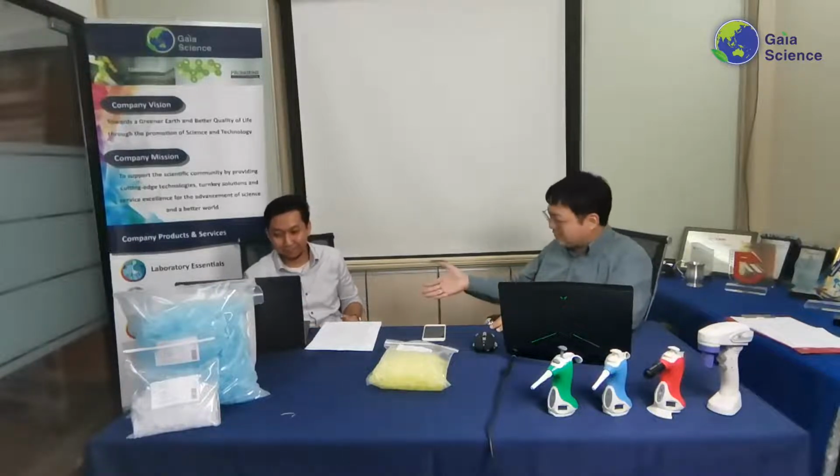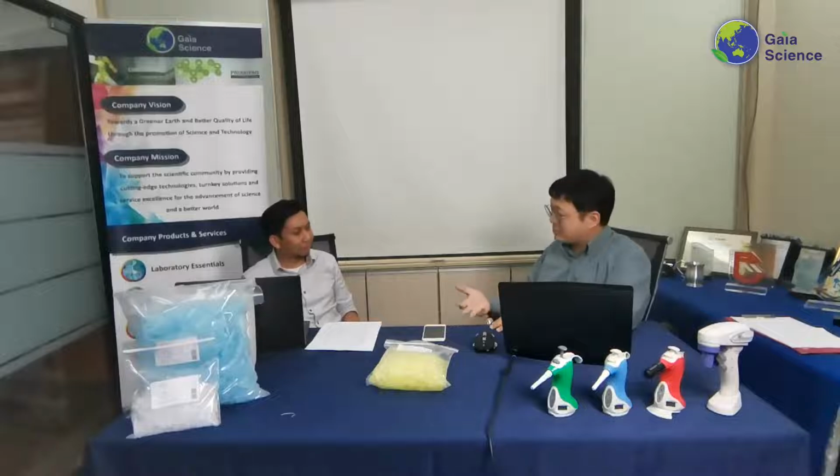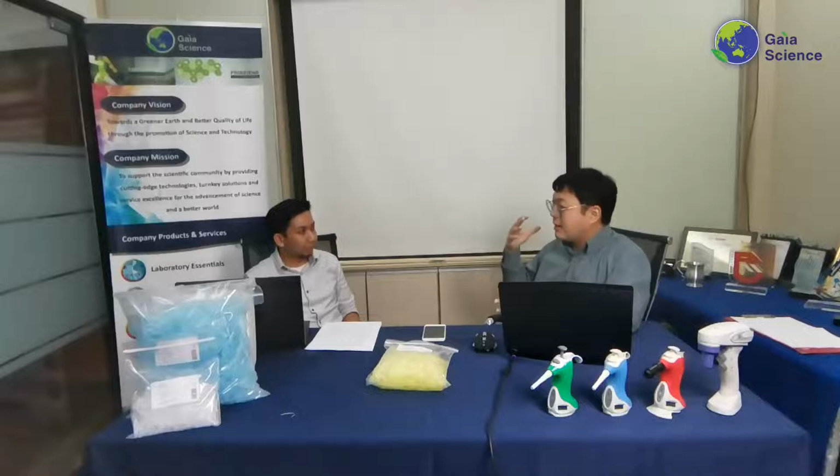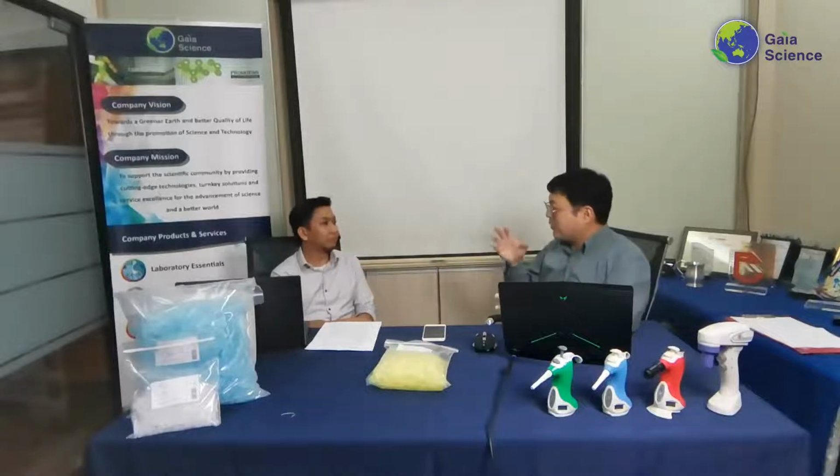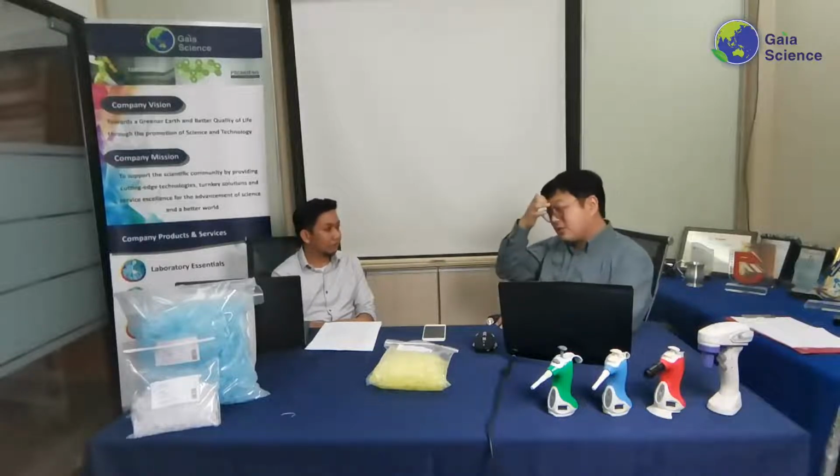So especially, like you said, aerosols, volatile, corrosive, and viscous samples are ones you want to avoid. You want to use filter tips so that you avoid getting somebody fainting as well, right? I remember a case where someone left the gas open a bit, or didn't cap it properly, and it was spreading around, and people fainted because of that. And the gas sometimes could be odorless as well, so that's the danger. And one last one: if you're using strong acids or strong bases, you also want to avoid splashing, so you use filter tips to prevent that from going up the chamber.